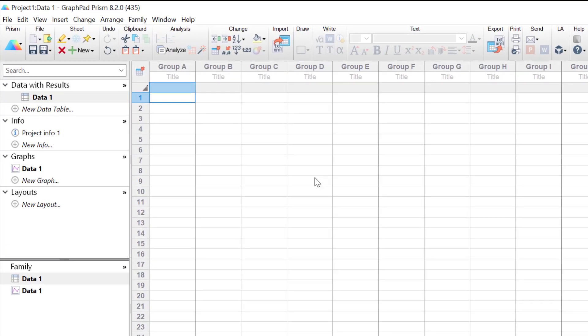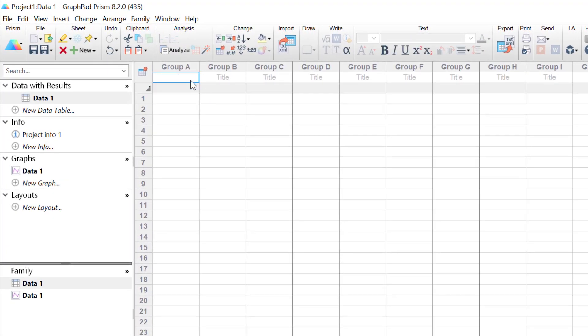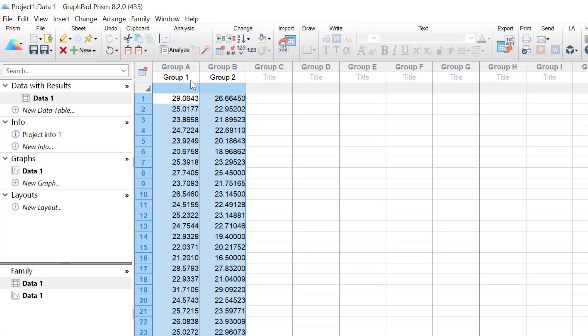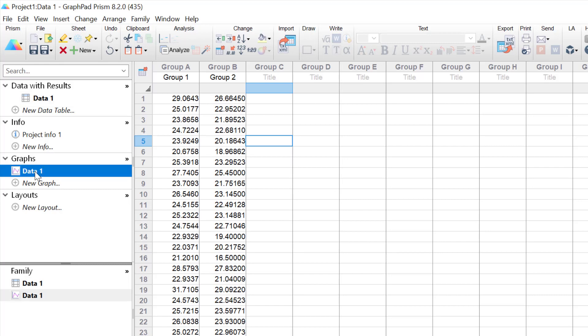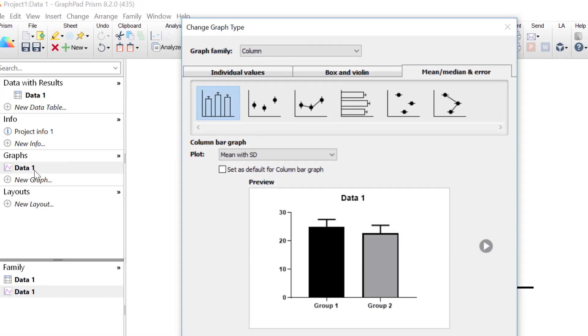I'm just going to copy in the data set that I've prepared earlier. Specifically, this data contains two groups of 23 participants. What these are are BMI or body mass index measures. Since we have pasted in our data, we can then click on the connected graph sheet on the left hand side to open up the graph wizard.